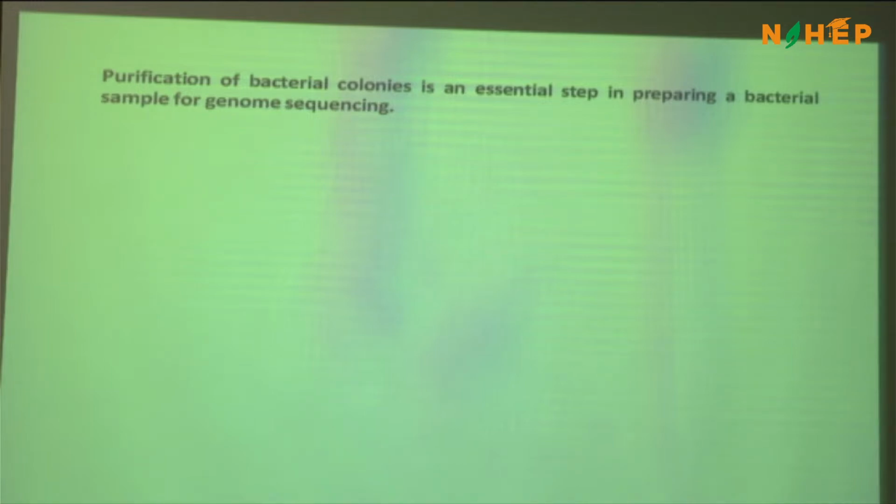What it does is, it gets converted into formazan, an insoluble salt, and that is accumulated in the bacterial cytoplasm, and it decorates the bacteria. That would help you to some extent. I won't say that it is going to help you all the way down to segregating two isolates, but certainly it is going to segregate different species of a particular genus, correct? So the colonies will look different. That is assisting you to take out the different species under the same genus.